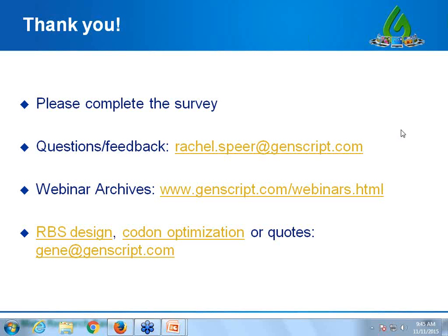Okay, somebody asked, I have ordered some codon optimized sequences. Can I order RBS design and attach it to my previously ordered sequences? Or is it possible for me to design RBS using your online RBS calculator and do cloning myself? So, great questions. Yes, you can definitely order RBS design for your previously ordered sequences. Again, the RBS region is about 35 nucleotides in the 5' UTR, and so we can take your previously ordered clones and just do a simple mutagenesis to swap out the RBS region.